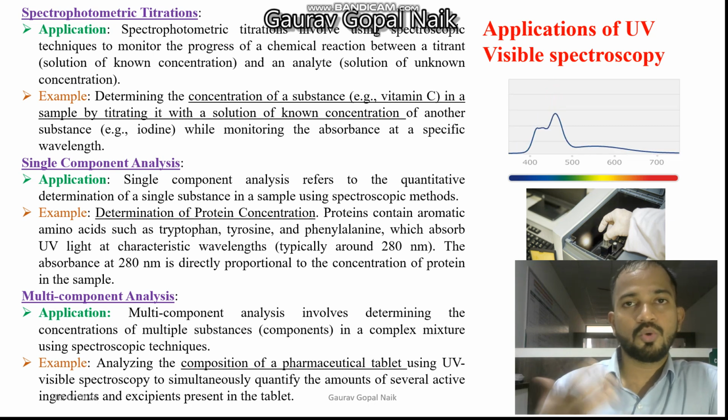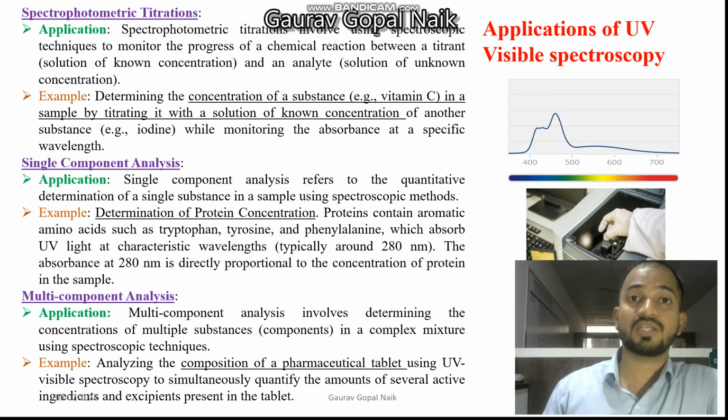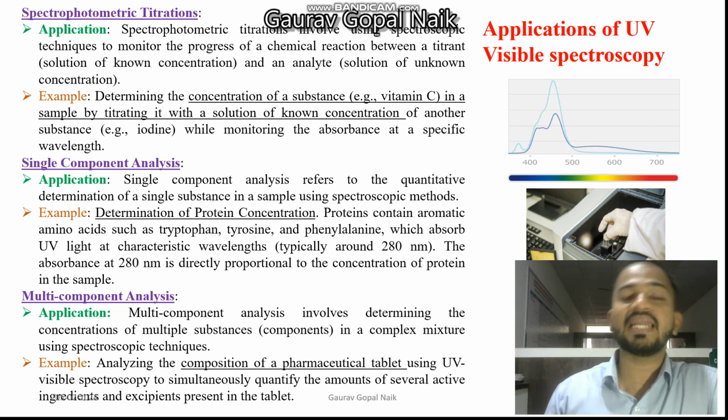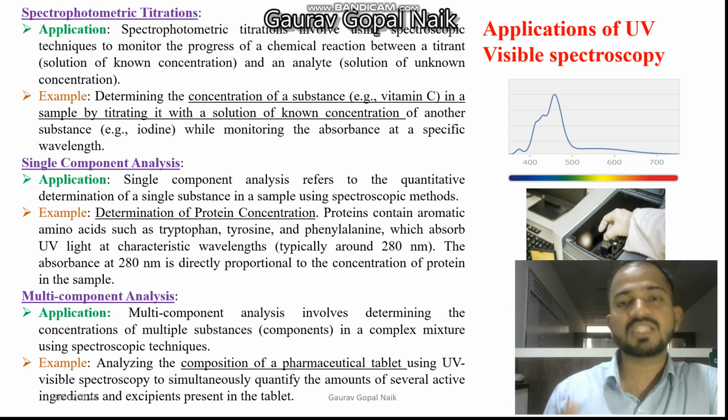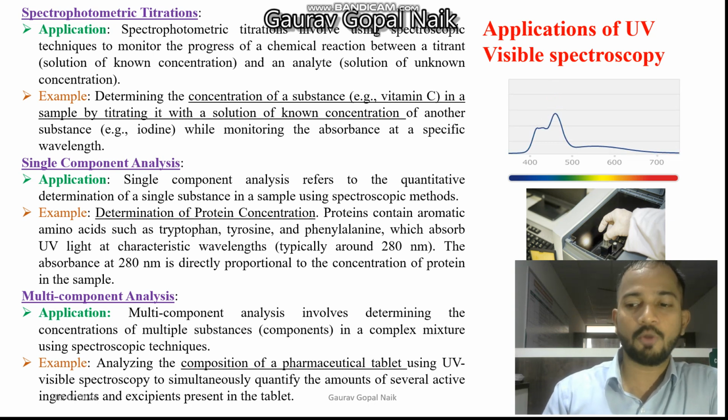So this is in brief. I have discussed the electronic transitions, the auxochromes, the chromophores, the instrumentation part and then applications in brief. So this session you can use to quickly revise your entire topic.